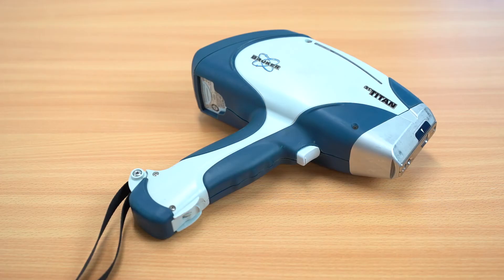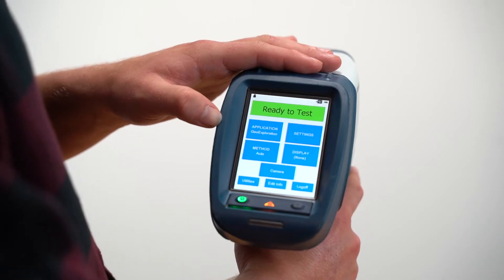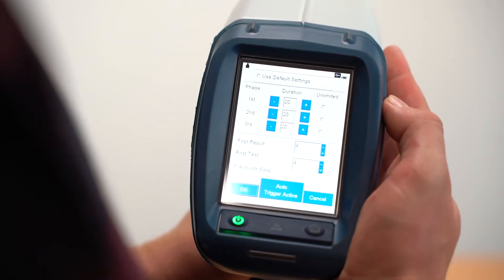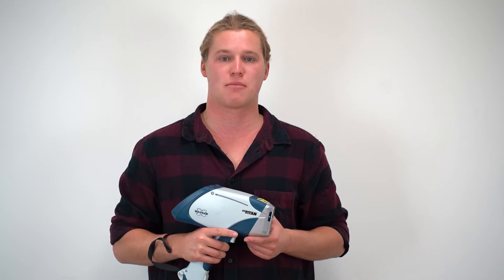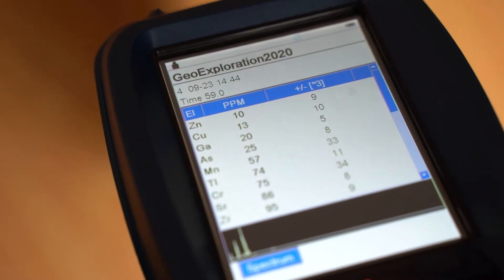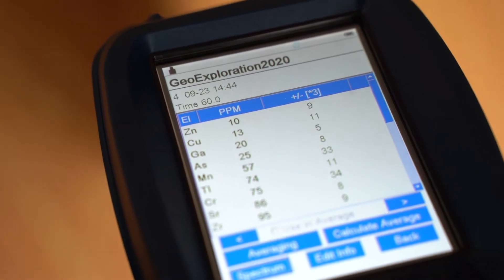For the analysis today we're going to be using the GeoExploration calibration on the Bruker S1 Titan 800. The calibration will run for 60 seconds and accurately analyse magnesium through uranium. It's crucial to run the analysis for the full recommended time — for example, if you're only analysing for 20 seconds rather than 60 seconds you will experience inaccurate results.